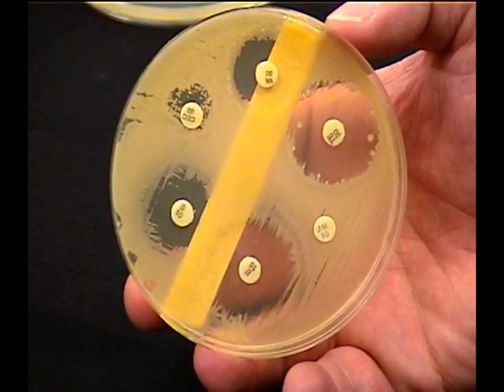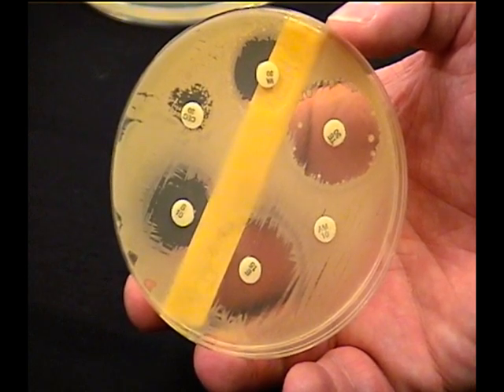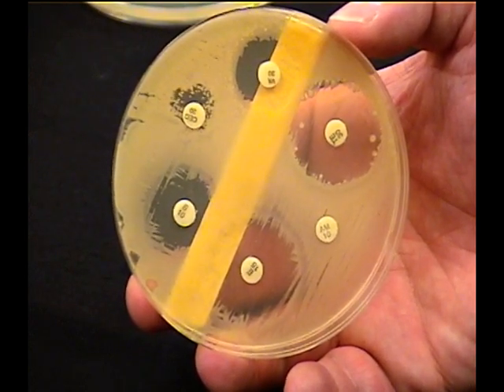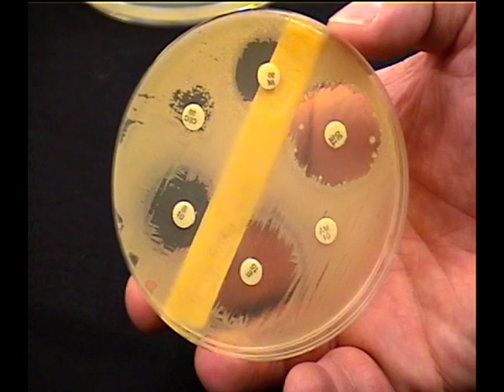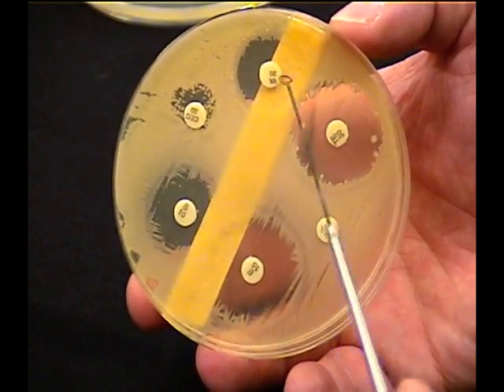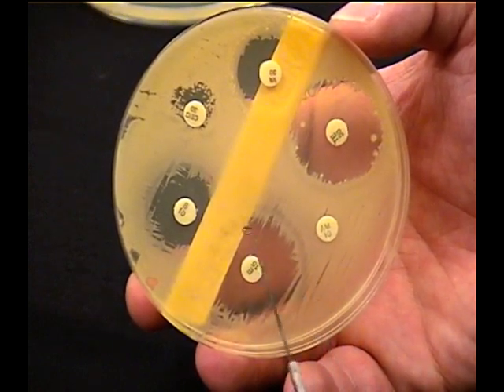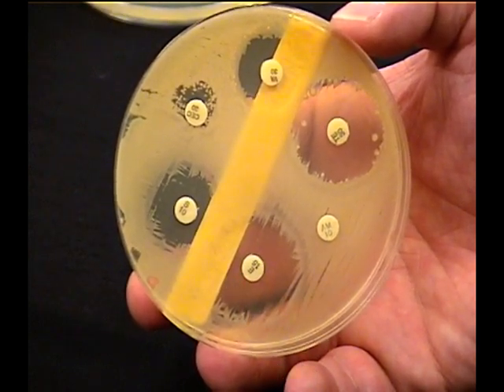So sometimes the bigger zone doesn't mean that it works better. It just means that it's smaller. Maybe this one happens to be a very big antibiotic and it actually works better than this one here, which might be a very small antibiotic.